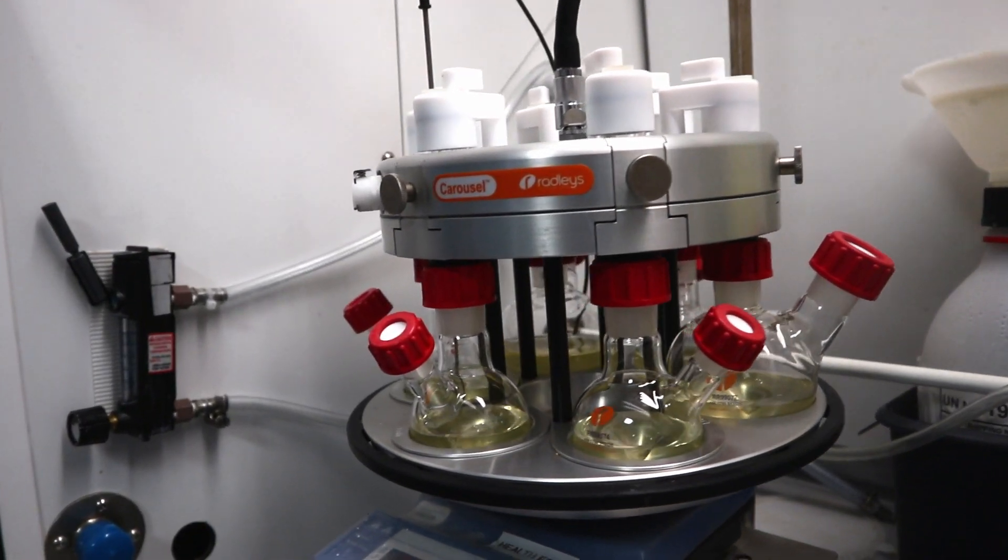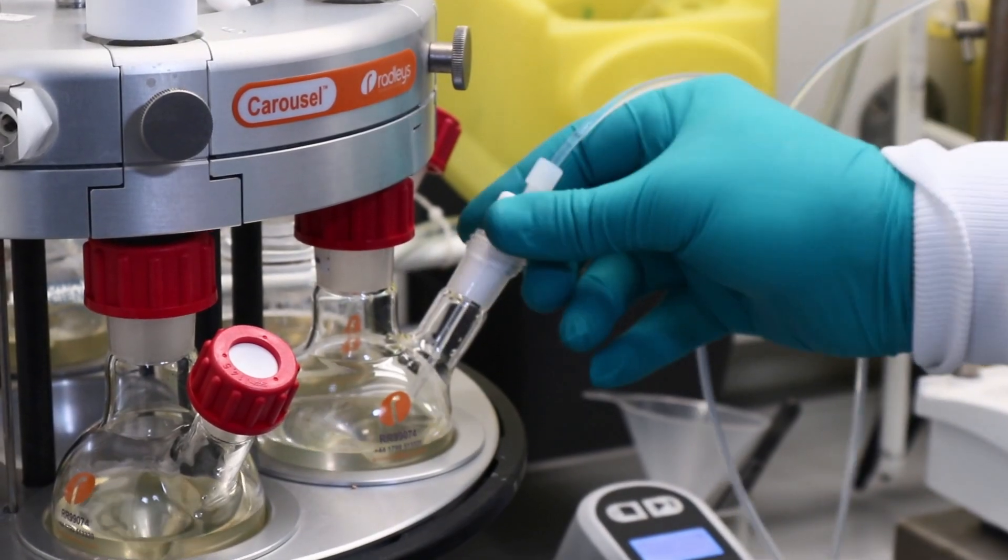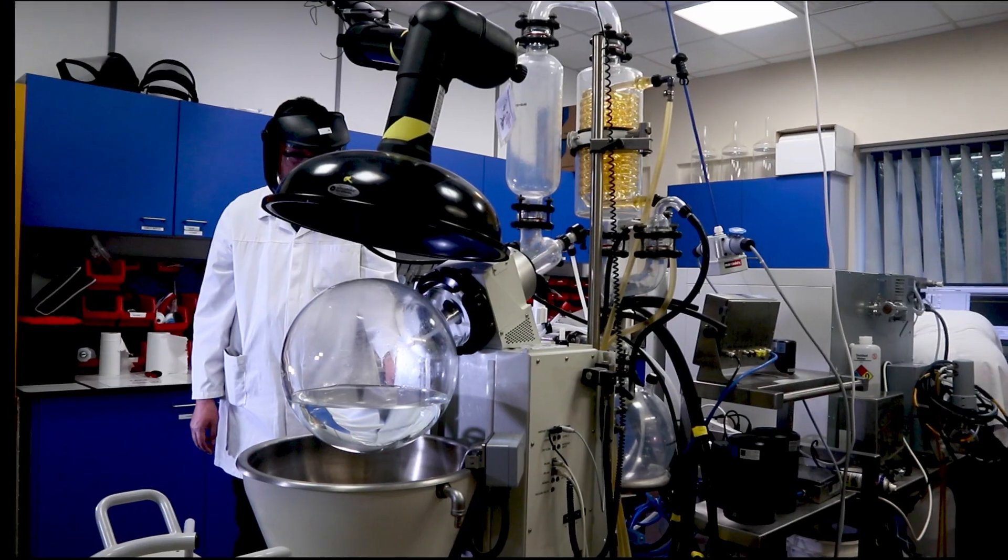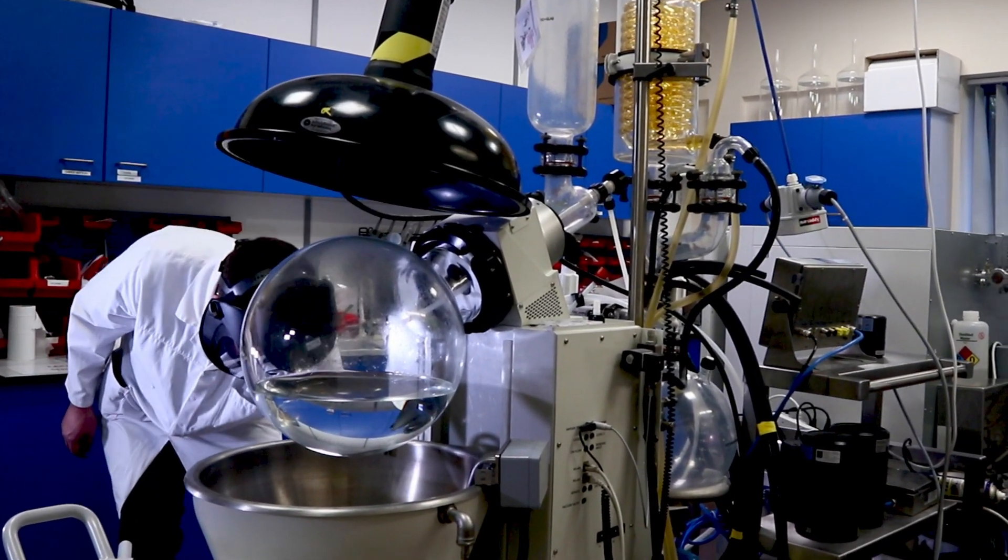As part of our chemistry development workflow, our team will conduct the necessary stress experiments to determine the boundaries of the process and robustness of the chemistry. We also use statistical experimental design to support our studies in Mettler-Eumax or polyblock multi-reactors.